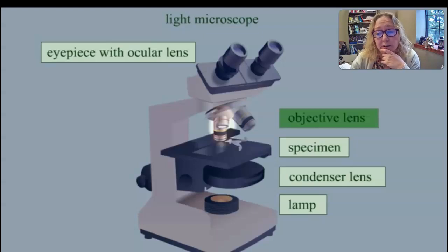We are going to talk about chapter 4, the microscope and the gram stain. I know you're excited because we're going to be doing that for about 3 weeks. We're just going to have stain. So much stain. So we're going to talk about how to use your microscope because that's actually going to be a real thing. And I cannot get everyone's microscope all by myself, so you have to lend a hand here. All right, let's talk about microscopes.